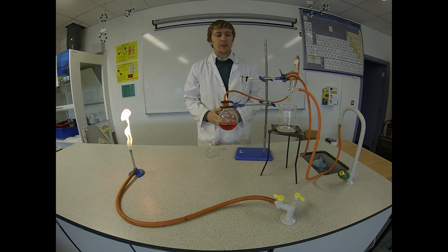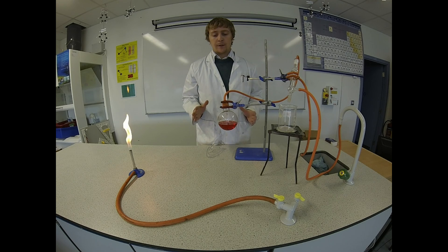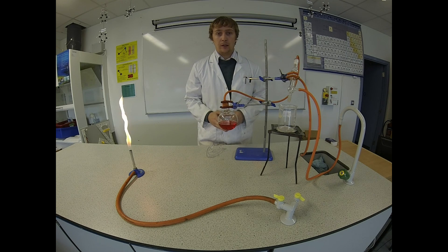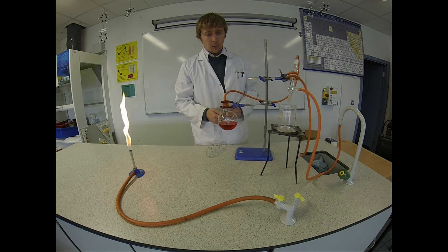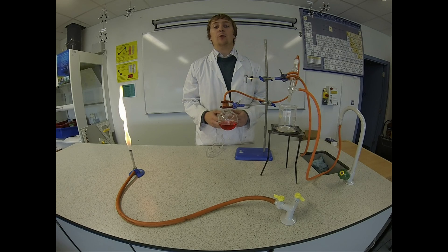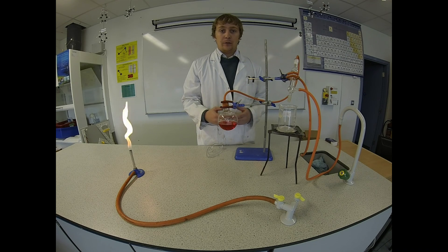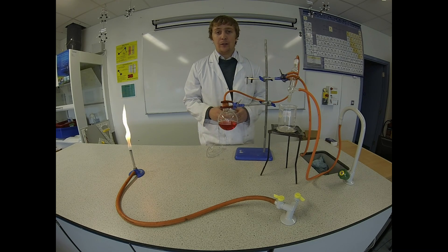Welcome to Science4Skills. In this episode we're going to separate a mixture of salt and water by distillation. In an earlier episode we separated salt and water by evaporation and we lost the solvent which was the water — we were only left with the salt. When you use distillation you're left with the salt and the water, so you save both the solvent and the solute.